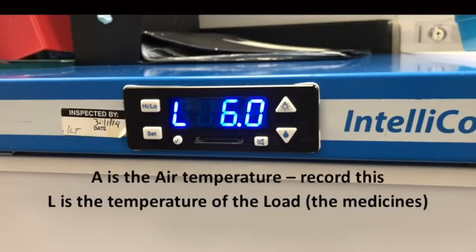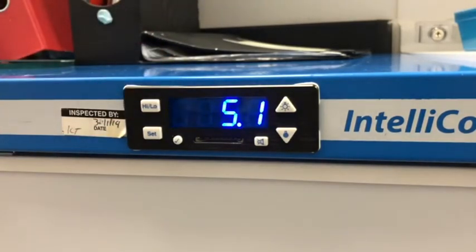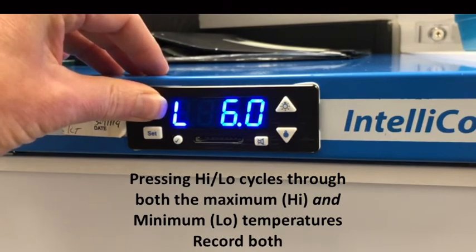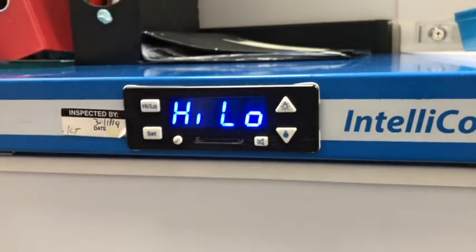The current temperature in the refrigerator is displayed, so simply record that. To check the maximum, press the high-low button and release. To reset the maximum-minimum recording, press and hold the high-low button. The display will change to flash high-low, then revert to normal operation. Release the button — you've now reset the memory.